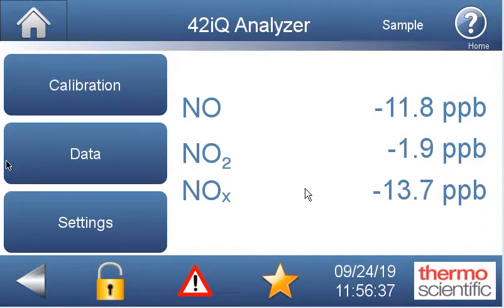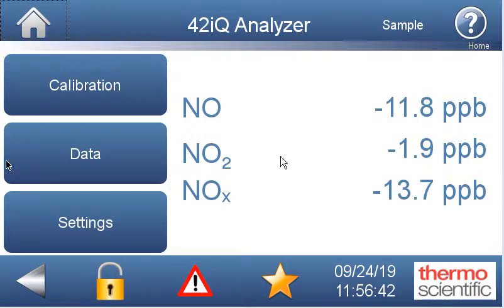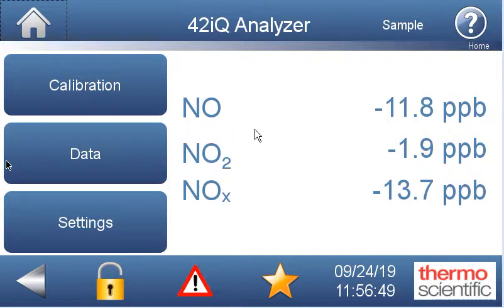I'm going to step through this a little bit quickly here, assuming you've got the user manual there too. It's got a pretty good description of how to go about this. This would be how to do a full PMT adjustment on the Thermo 42IQ.